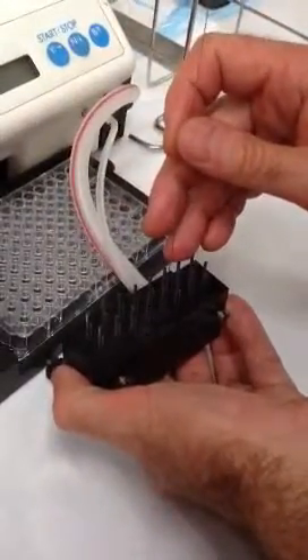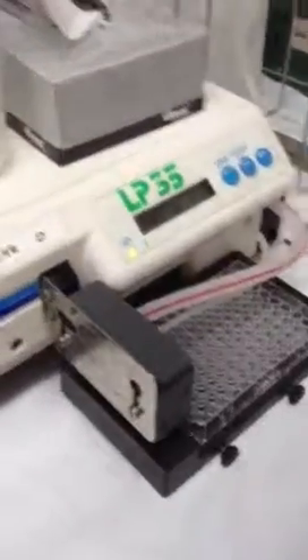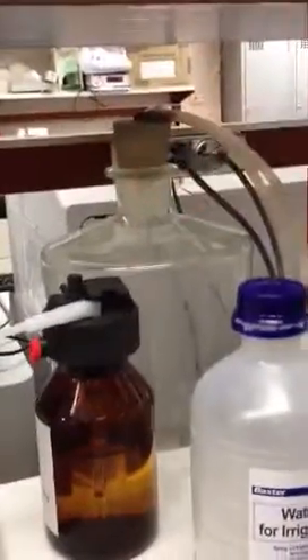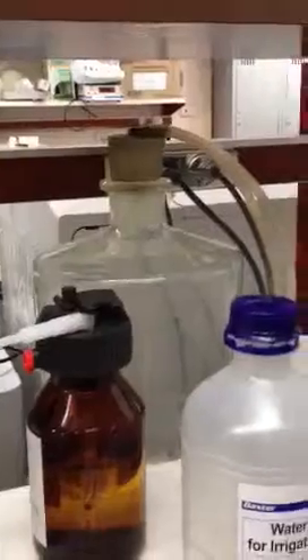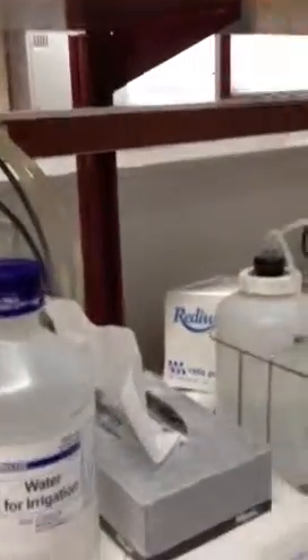This probably shouldn't be blocked. So what I'm going to do is play with it at the moment. It won't work if it's not sealed. You've got to make sure it's sealed. I've got a smaller bottle — with the smaller one you've got to keep remembering to empty it. Don't overfill it because if solution gets through it, you're going to mess up the machine and also your assay.